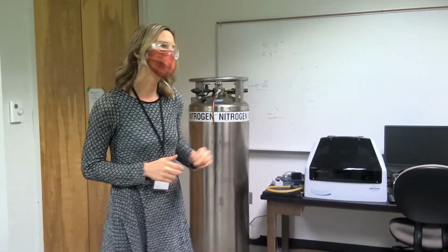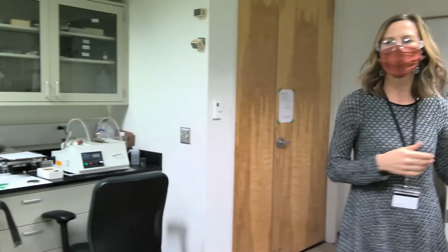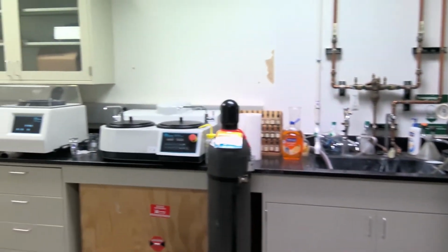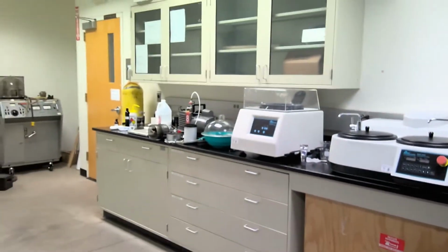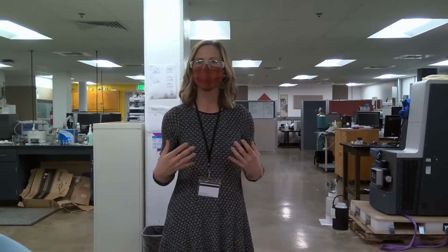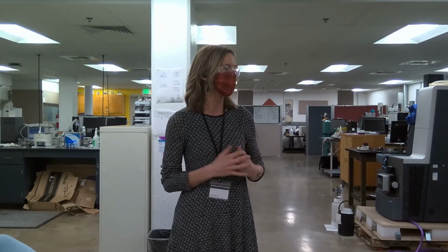This laboratory also has a profilometer to look at surface roughness and a bunch of sample prep equipment for the EM lab, such as a gold coater, polishers and cleaning equipment prior to the analysis on the EM. Each of our laboratories has a dedicated lab manager supported by a crew of scientists, students, and postdocs. They're the people who keep these instruments happily humming and make sure that you can get the highest quality data these instruments are supposed to provide.